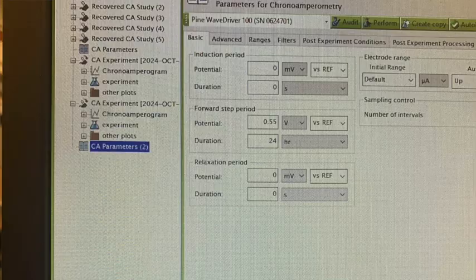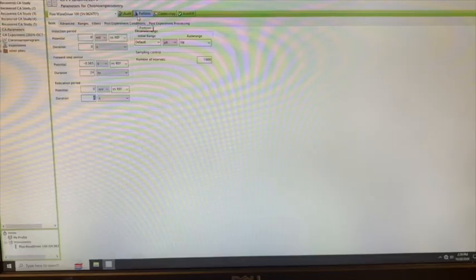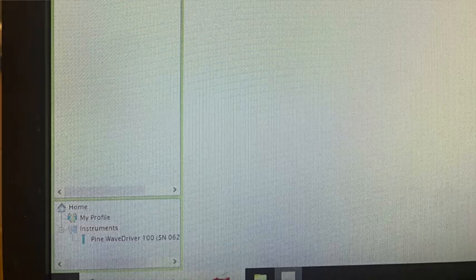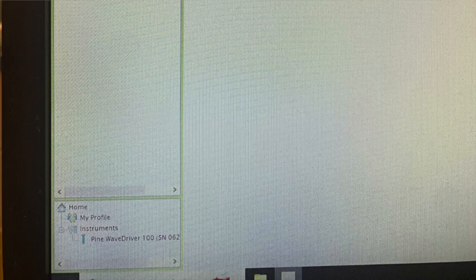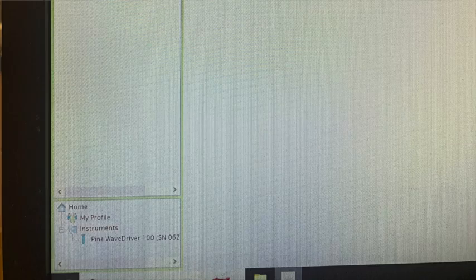The potential for the relaxation period is also zero, as is the duration. You'll want to make sure that the pine wave driver is registered and connected to the computer, seen in the bottom left corner. Then you can hit perform.